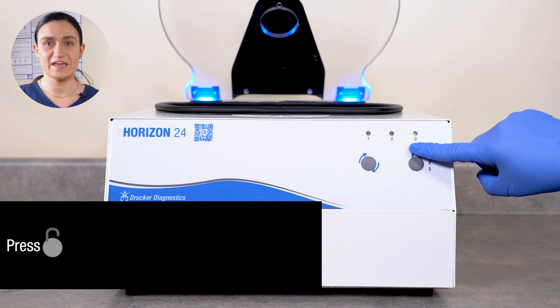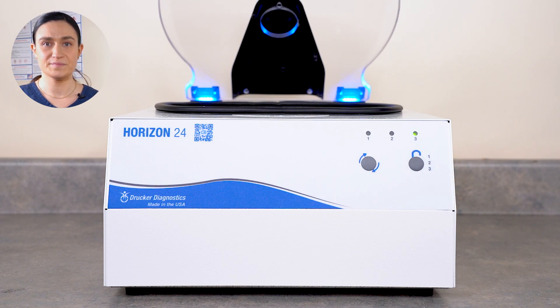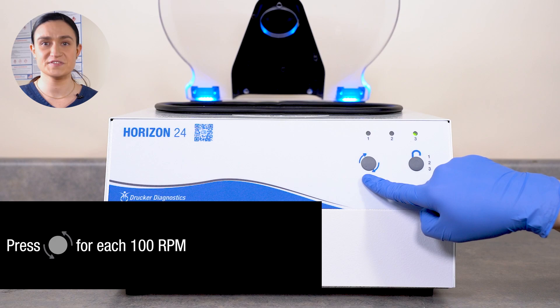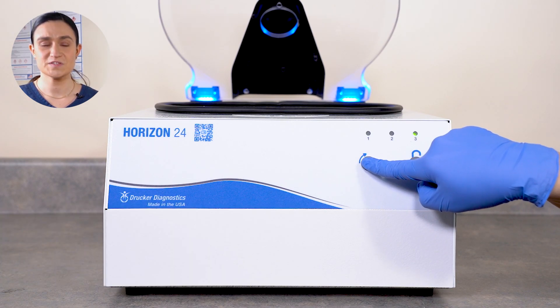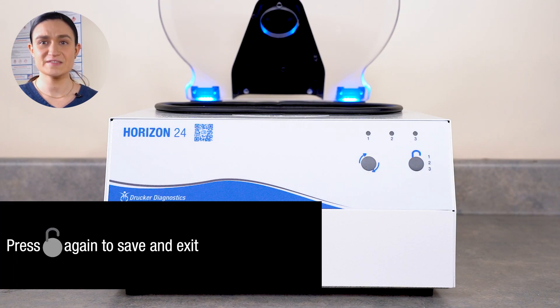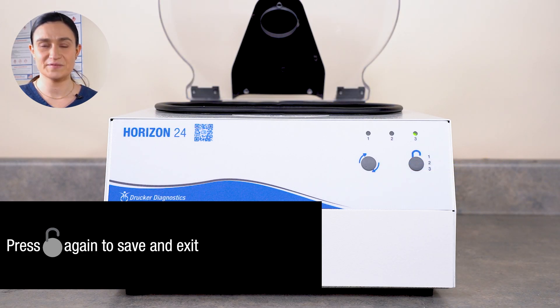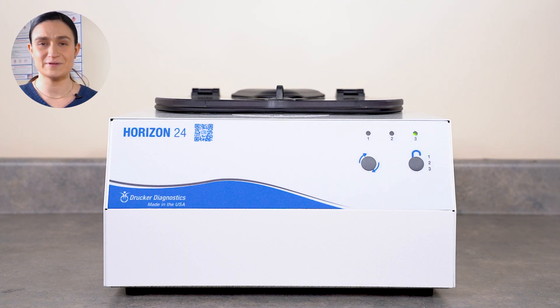You will see the cycle indicator light flash. This means you are in speed edit mode. Press the start button once for each 100 RPM of speed. We're spinning at 1000 RPM, so we're going to press the start button 10 times. Once you're finished, press the stop unlock button to save your new settings and exit edit mode. Then close the lid. Your new cycle will automatically be selected and ready to spin.